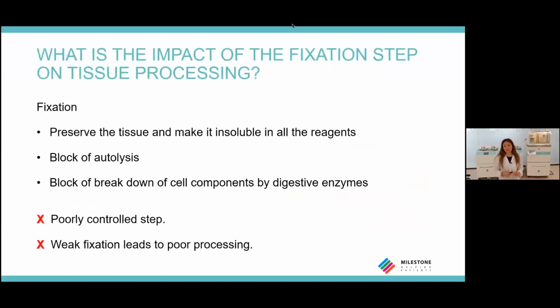Fixation is essential to preserve the tissue and block the autolysis and the breakdown of cell structures. The fixation step is one of the most crucial, but also least controlled of all the steps, and it really affects the quality of the final results.